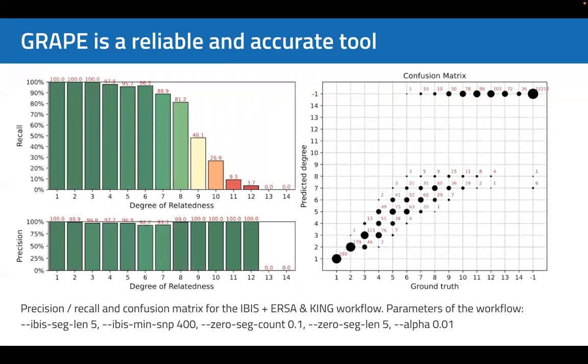These changes have significantly improved GRAPE as user-friendly, fast, and accurate software. It has many different parameters to control the behavior of underlying tools and algorithms, to effectively control the false positive rate, and to adapt GRAPE for various research and production applications.